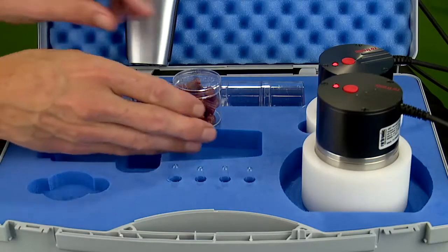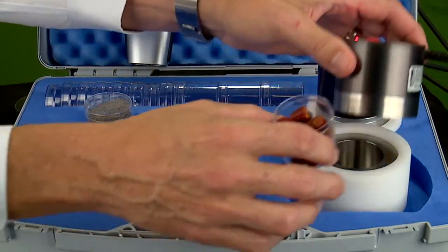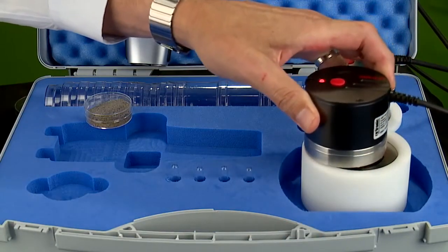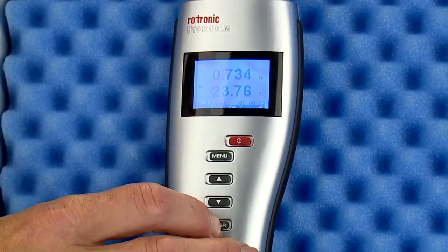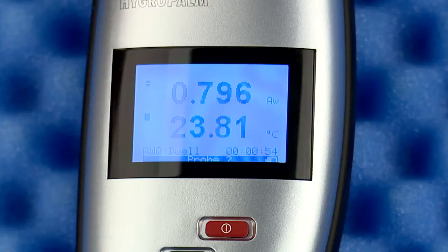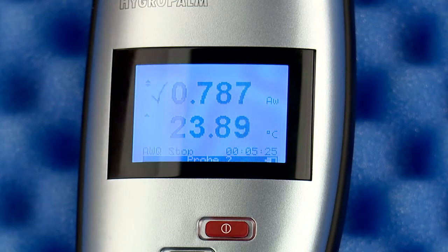Once you have prepared your sample for testing, simply remove the lid from the sample cup, place the cup in the sample holder, and cover with the HC2AW probe. At this point, simply press the enter button. Once pressed, the display changes to dwell. Based on the default settings, dwell will run for four minutes. When the dwell time has passed, the display will change to running. When the test is finished, there will be a five-second tone from the unit indicating the end of the test and a check mark on the display.